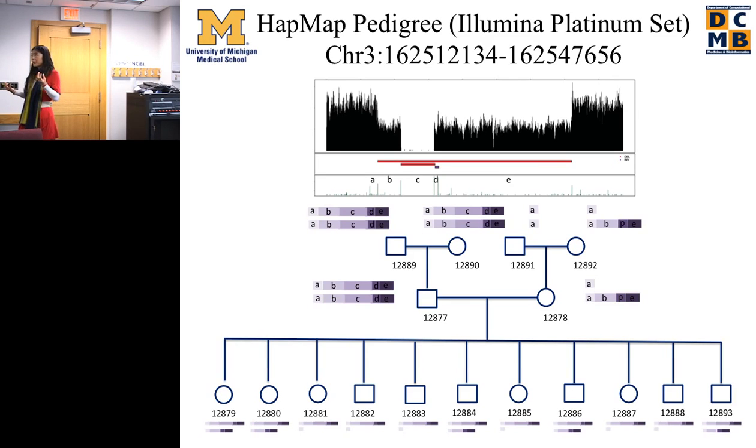For example, if a breakpoint is very close to the centromere or the telomere, or if there's a tandem duplication like a satellite region, the reads map back very messy. You have a lot of clipped reads everywhere. But to define a breakpoint, we require at least 5 reads clipped at the same position, which is impossible for this region, so we just miss that.